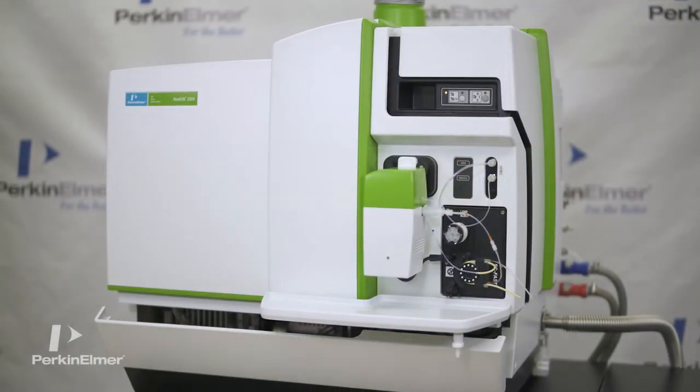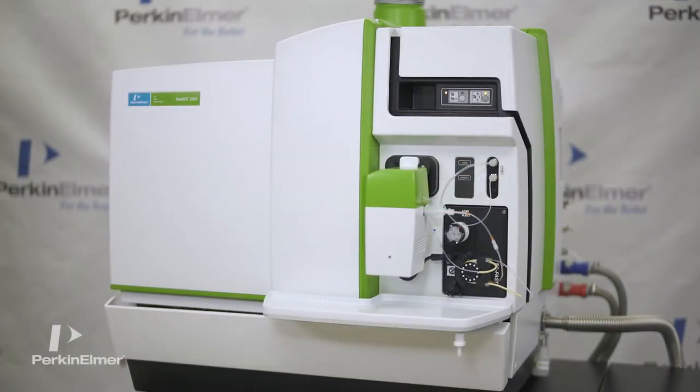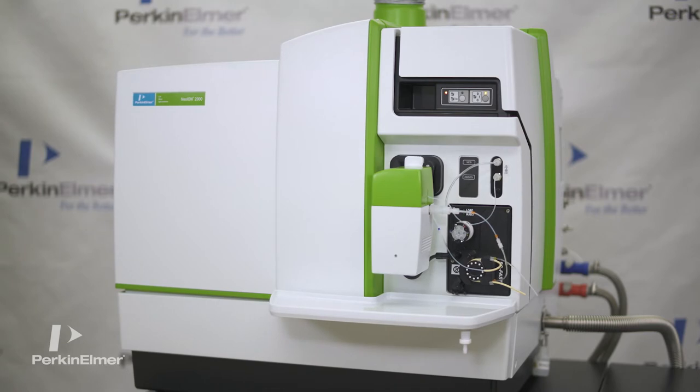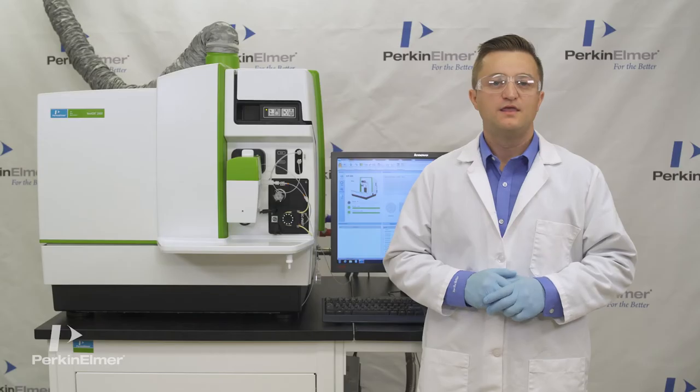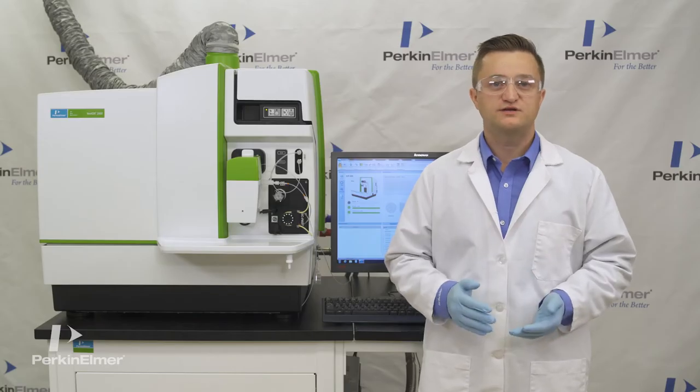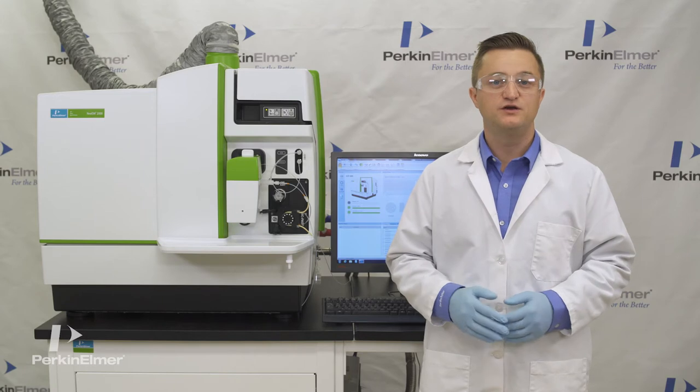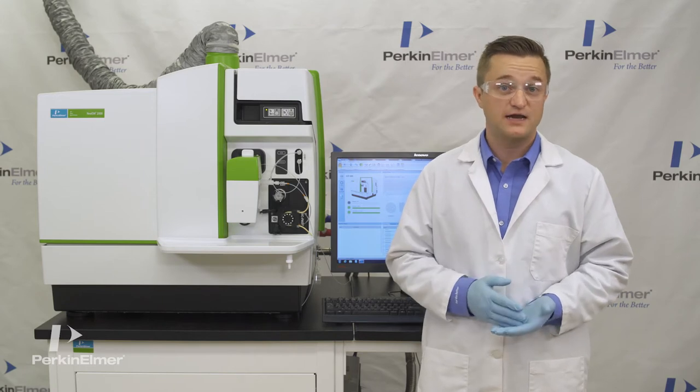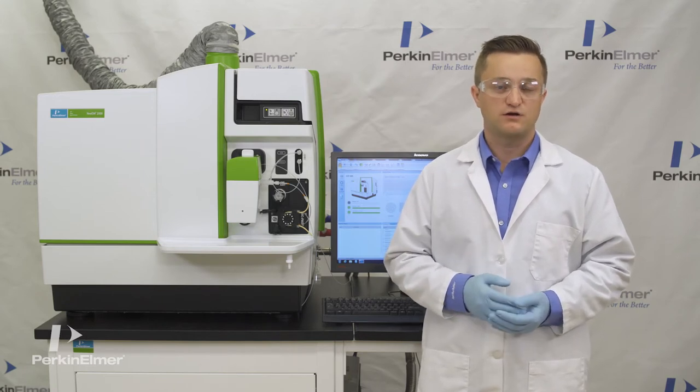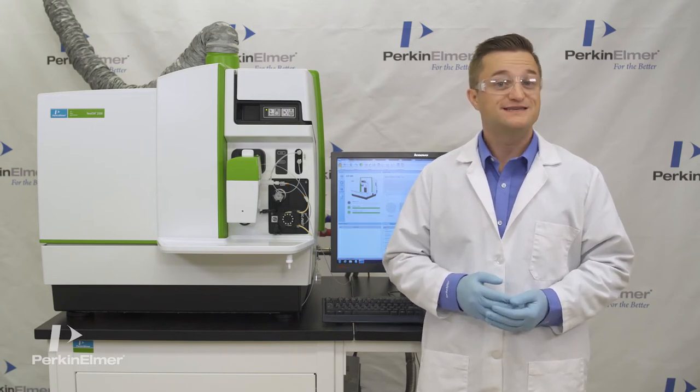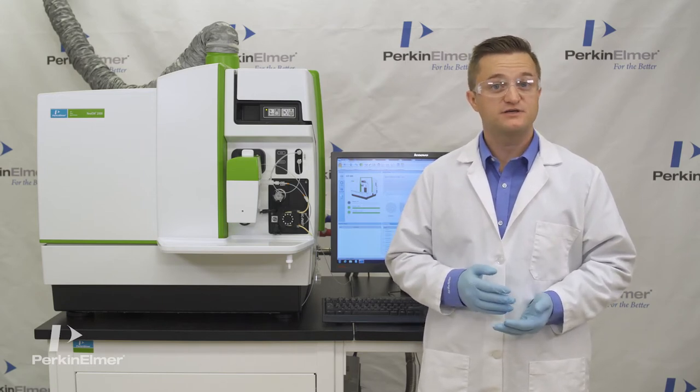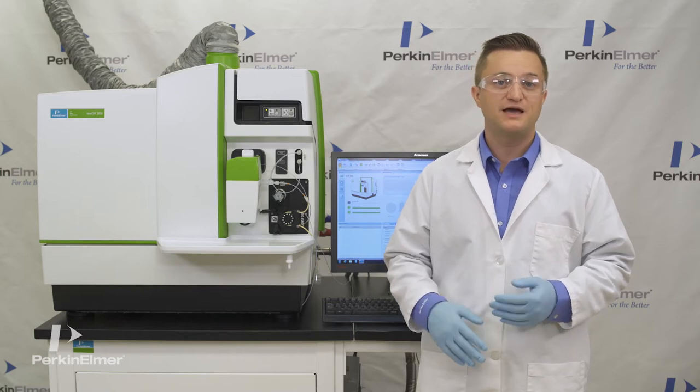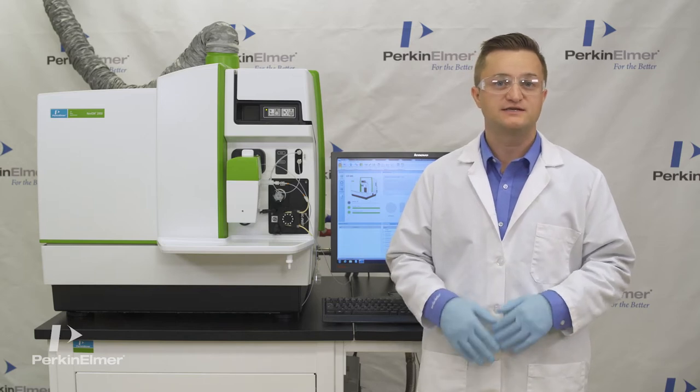One of the most pronounced innovations featured by the Nexion 2000 is the new RF generator and load coil. The entrance matrix tolerance is further enhanced by the new solid-state free running RF generator designed by PerkinElmer scientists to deliver superior plasma power and stability.